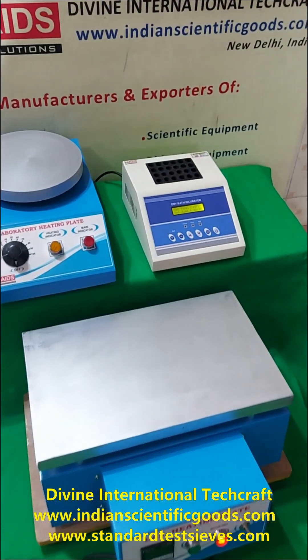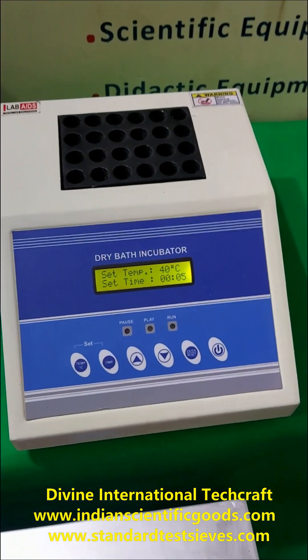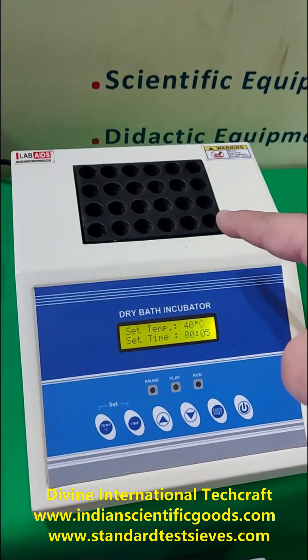We also offer block heaters or dry bath incubators for heating samples in test tubes. A solid state aluminium block unit is provided in the instrument for heating, and it can hold up to 24 glass tubes.